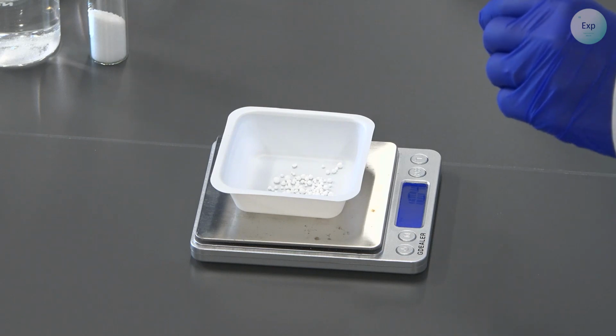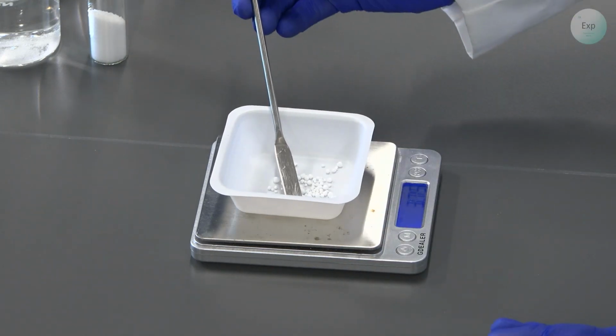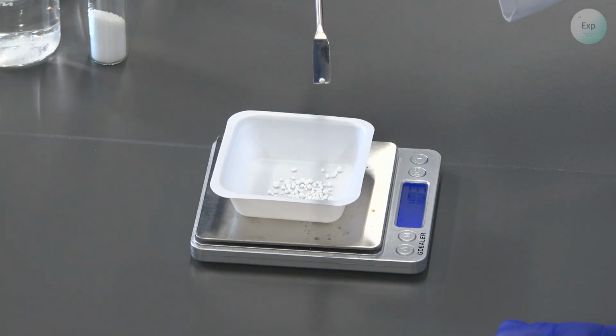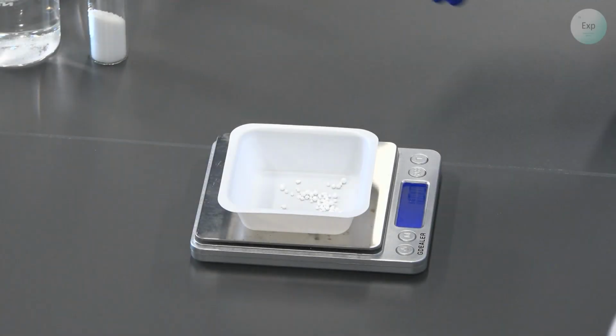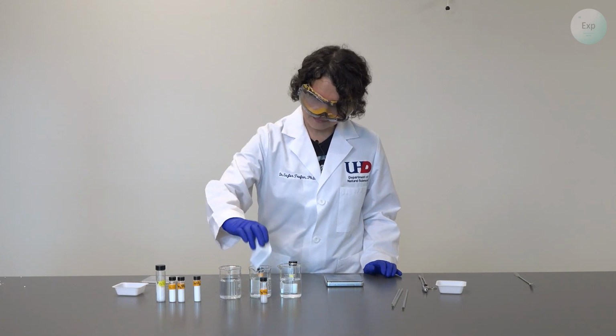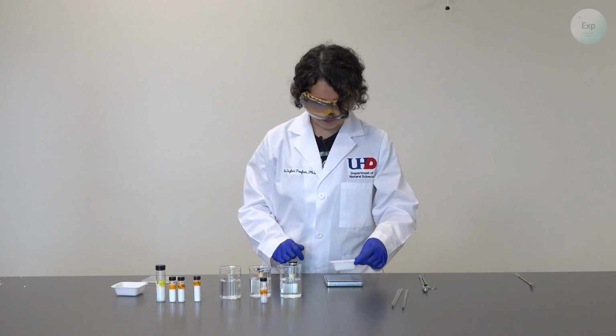It is 1.004. We don't want to exceed the 1.00 grams, so any excess we're going to remove and discard in a waste container. Now I have 1.00 grams of calcium chloride measured. I will transfer this in the second beaker and place my other weighing boat to the side.